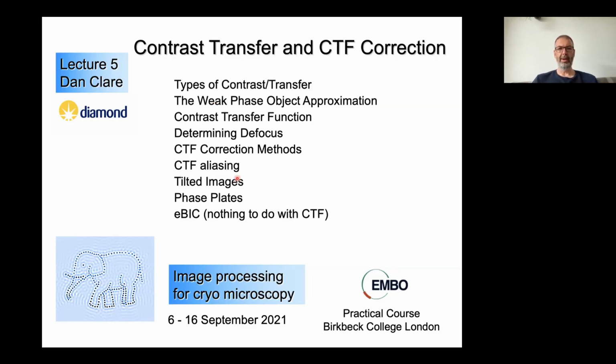I've put in a little bit about CTF aliasing. This is important for higher resolution work. Then something about CTF related to tilted images, a little bit about phase plates, and then just a plug for EBIC, which is based at Diamond and is where I currently work.